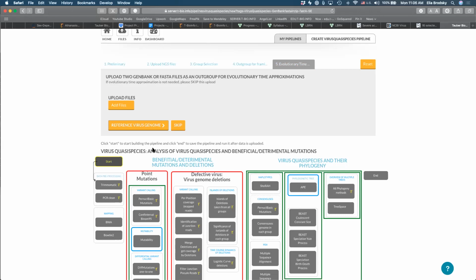In other words, if I have 100 mutations difference between the two, and I think that they needed maybe 10 iterations between the origin and the observed sequence that I have today, I can now give it a rate of mutation, but I still don't know how far away that was in real time.